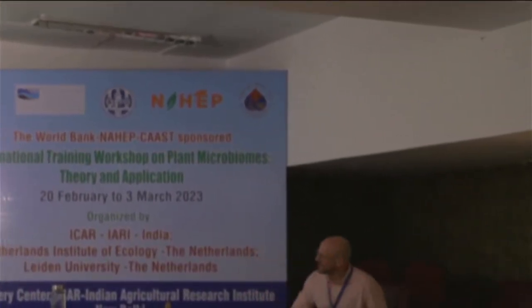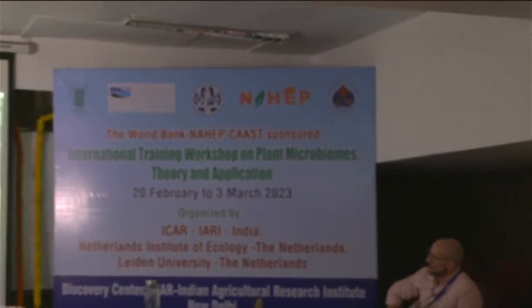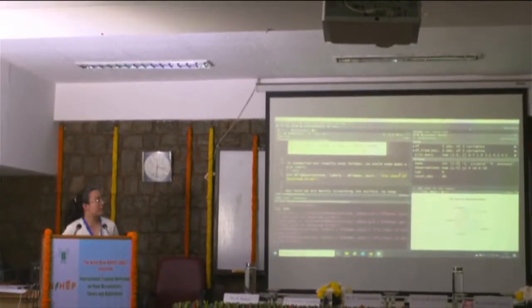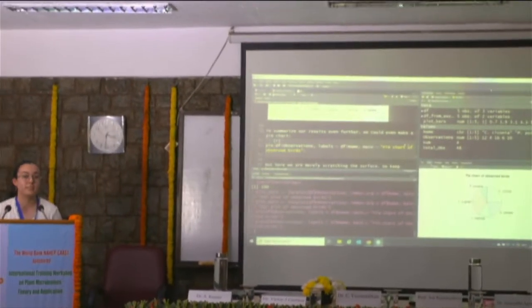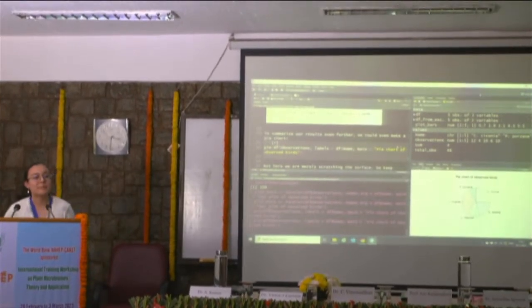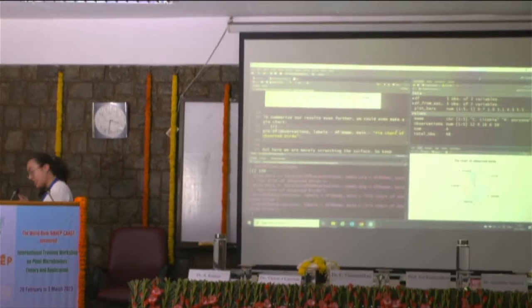So this was the exercise. This was the coding part. Right now, I also want to talk to you a little about extra tools that you have from R. Because, well, these plots, I don't know about you, but I would prefer a prettier plot for my paper than this one. And there are many, many options to change that. And there is a website that is great for this, which we can go to the navigator right now and check it.